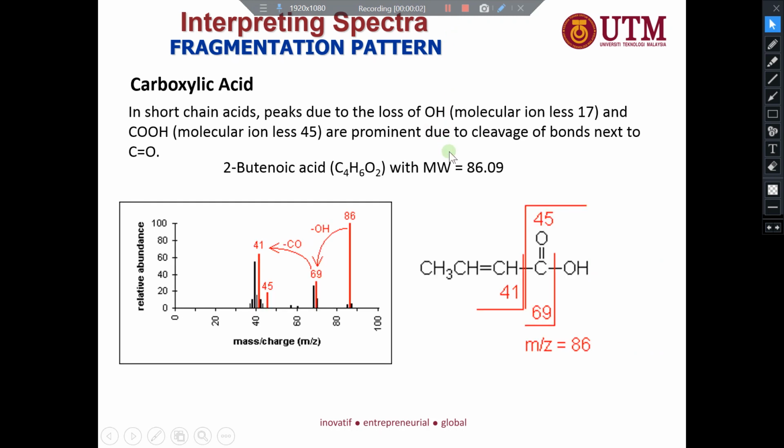Right. The next one is carboxylic acid, the fragmentation pattern for carboxylic acid. In the carboxylic acid as well, the preferred, the common cleavage, the most preferred cleavage is after or before the C double bond O. Kalau kata kat sini, dia akan potong kat sini lah.